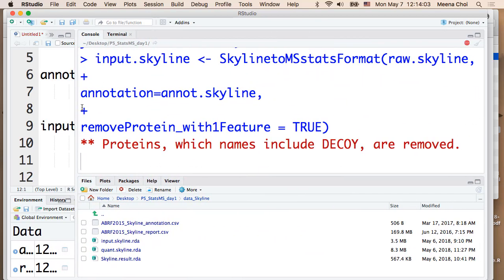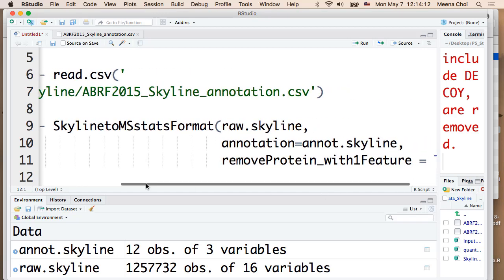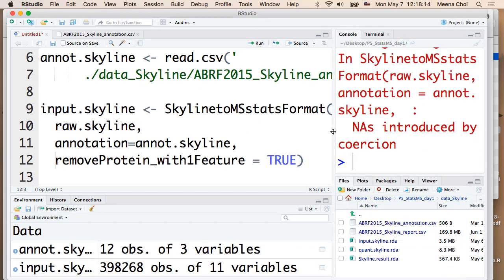And then they start to show something here. People who type this and press run, you got the data input Skyline. Please put the blue sticky note if it worked. If you have an issue, please put the red one. Most of you have an input Skyline.